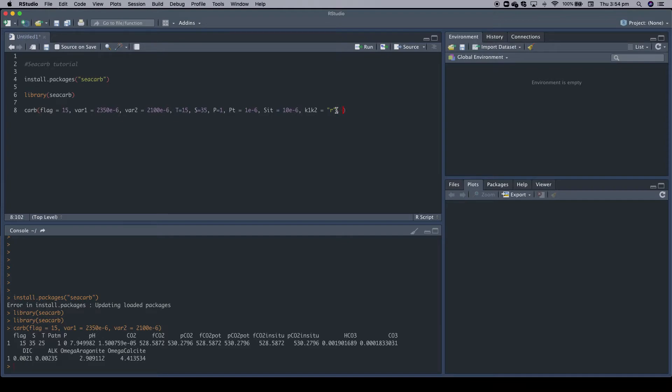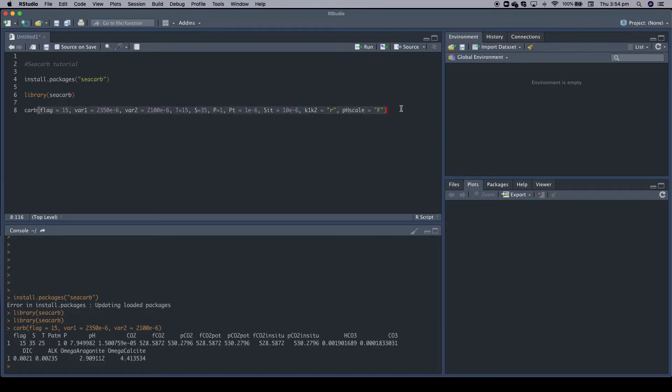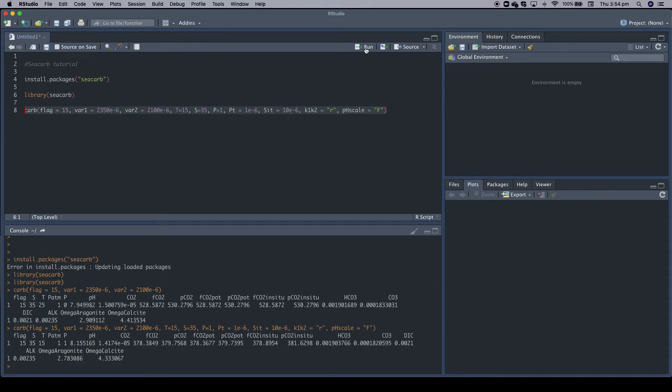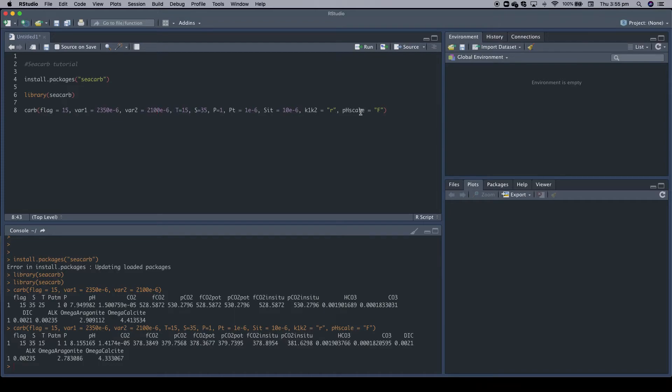We can continue with more and more input variables. And again, the documentation gives all the different choices. But let's stop here. Oh no, one more thing. The pH scale, always important. Let's set up the pH scale. The default scale used by CCARB is the total scale. But let's use the free scale, which would be an F for our calculations. So now we can do another calculation. Let's do it. And here we go. So we can calculate the carbonate system with our input variables as defined here. That's the simplest way to do it.